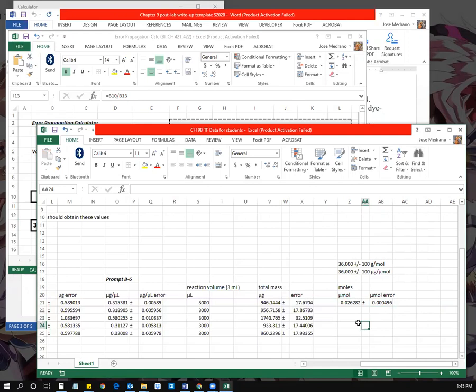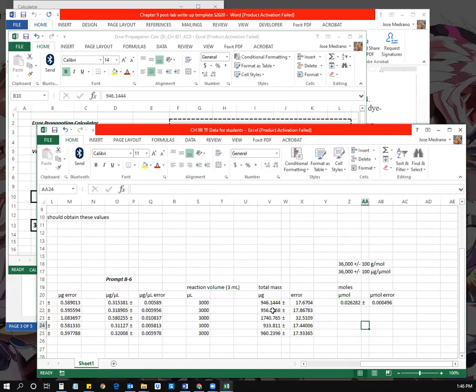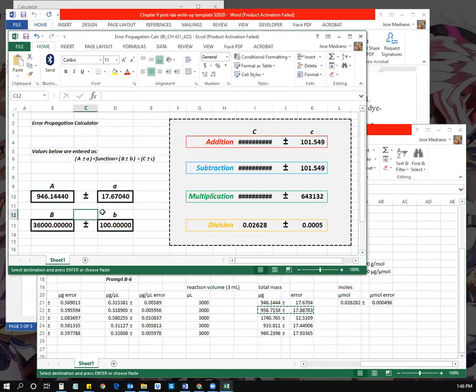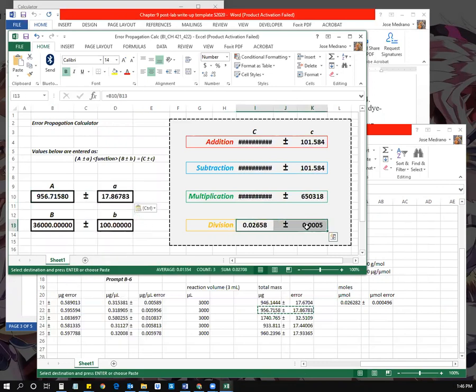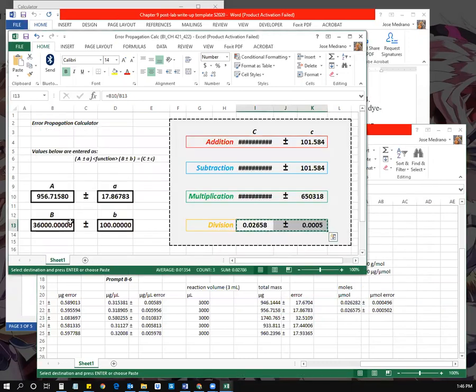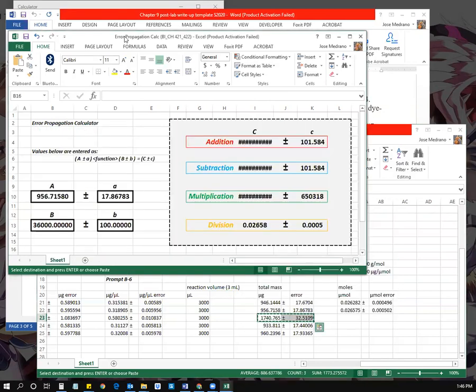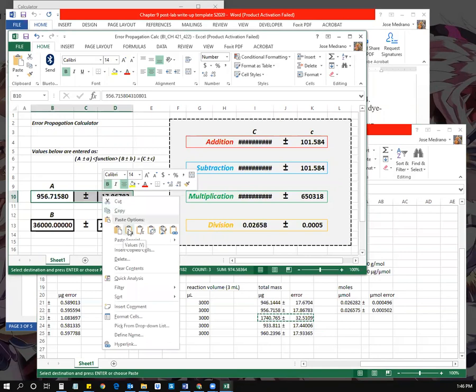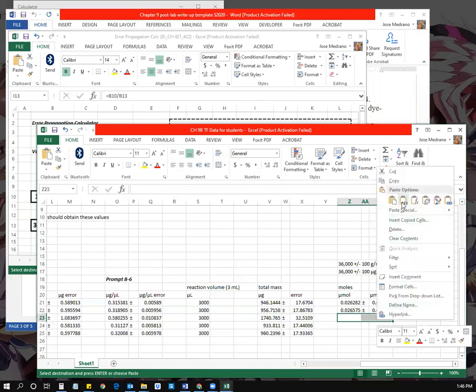And that's basically what I am going to try to do for the rest of these values here. Because I set this up so nicely for myself, I can just go ahead and copy what I want to be the first value and error here, highlight all three of those cells, and just paste in the values. I can just start copying everything very quickly for my values, my calculated values and errors for the micromoles. Then the next one will just be here, going like this, copy the values. This one again, of course, is going to be overblown because it has SDS in it.